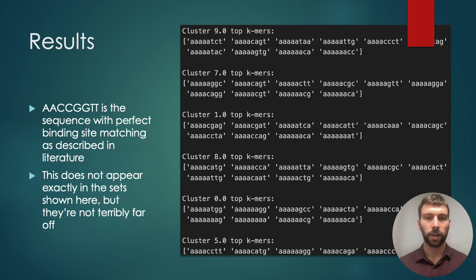However, it seemed more likely to me that they had been selected alphabetically rather than due to preferential binding. That said, if this error is ruled out, this would be an extremely useful result demonstrating that there are likely multiple binding sequences for GRHL2, and that a sequence of adenines is the most important component for this protein to bind. Regardless, this exercise is a proof of concept that it is fairly straightforward to group sequences based on base similarity and correlate these groups with experimental binding intensity.